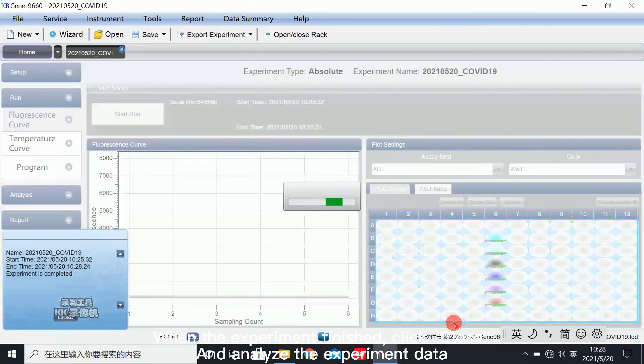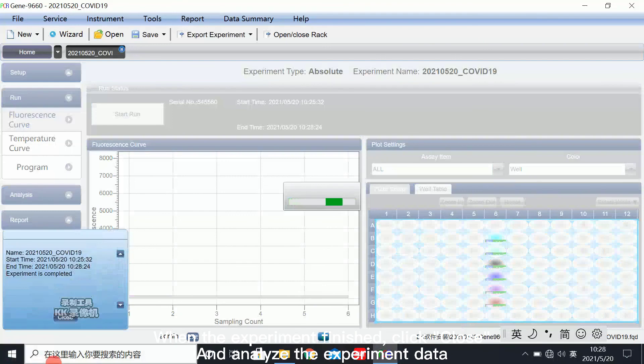When the experiment finish click closed and analyze the experiment data.